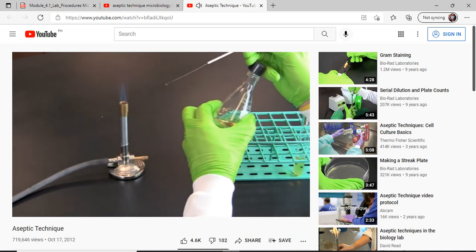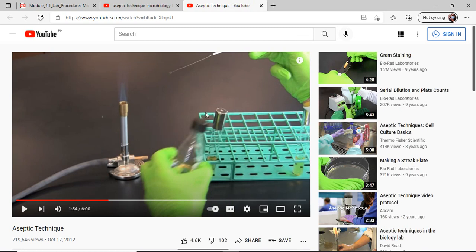Okay, so as you can see here, in handling the cup, okay, with the use of its right hand, if you are right-handed, usually you handle your needle like a ball pen, okay. The lid is opened with the use of its pinky. Transfer the bacteria to a petri plate. Lift the lid of the plate and hold it over the base as a shield to prevent contaminants from falling onto the plate. Spread the bacteria over the entire surface of the plate in all directions. Rotating the plate a quarter turn between spreads will ensure that the bacteria is spread evenly across the plate.